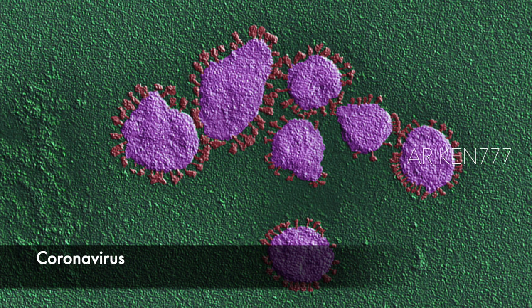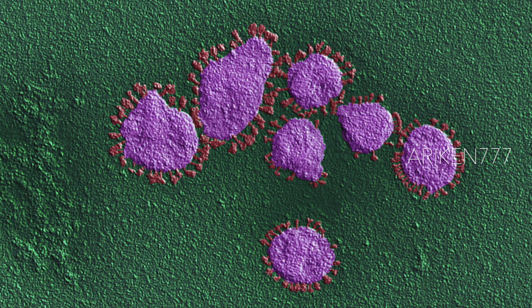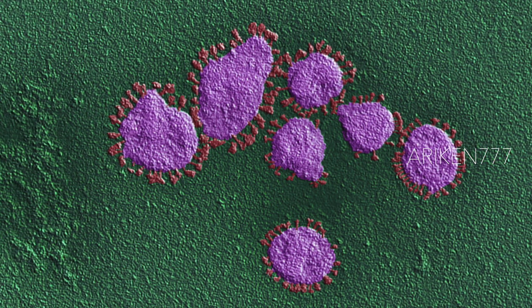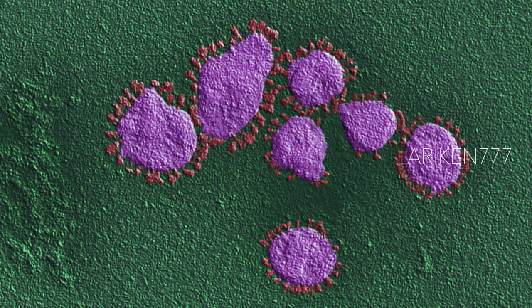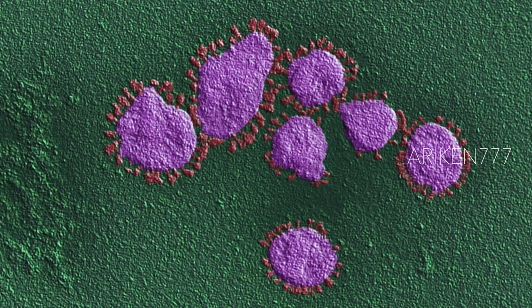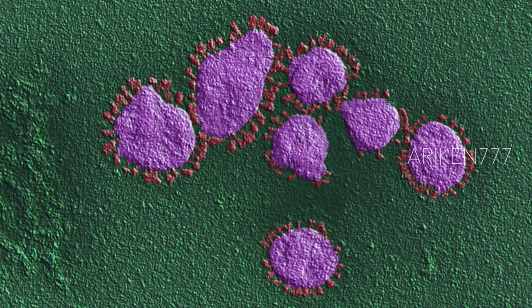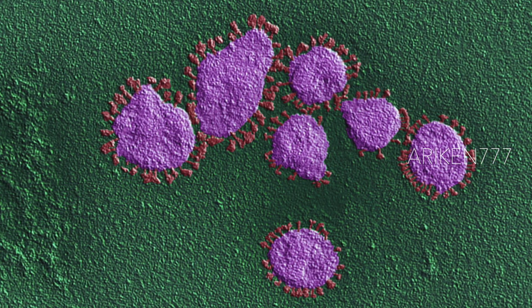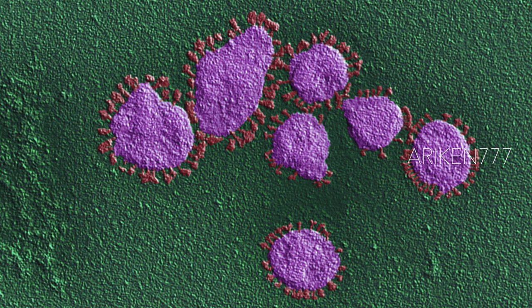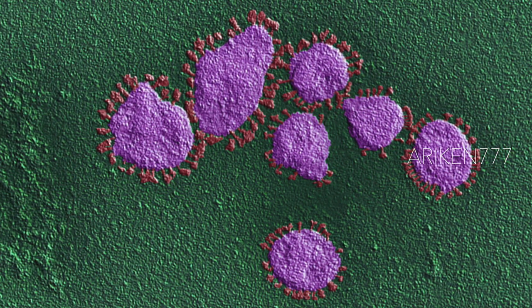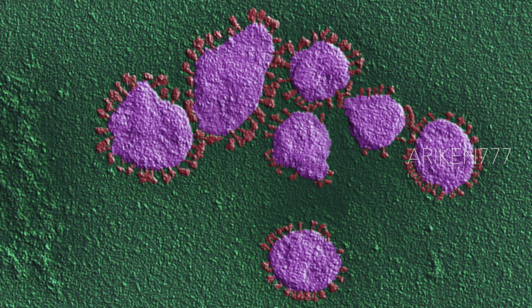Coronaviruses developing inside a cell. Coronaviruses are among the largest RNA viruses. They have a viral single-stranded RNA molecule that forms a protein complex together with a capsid protein. Coronaviruses produce respiratory and gastrointestinal diseases in humans and animals. About 25% of common respiratory diseases in humans are caused by coronaviruses. The novel coronavirus, like the SARS virus, belongs to the beta coronaviruses. SARS coronavirus causes high fever, difficulty breathing, coughing, and pneumonia.